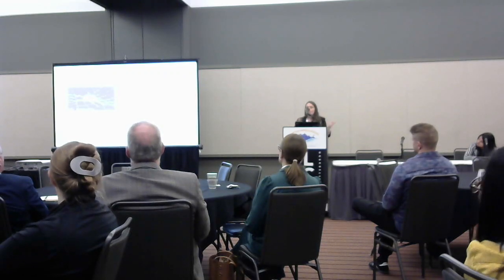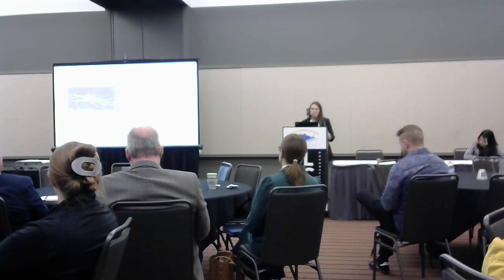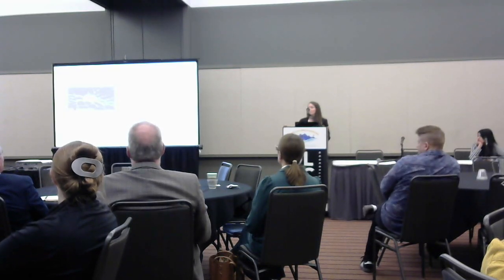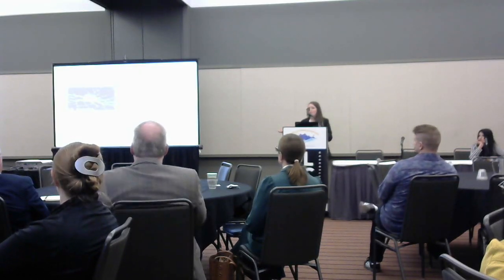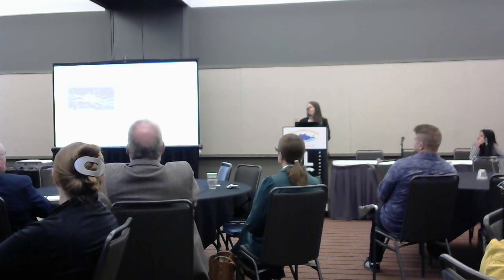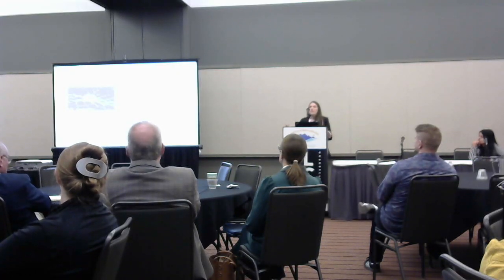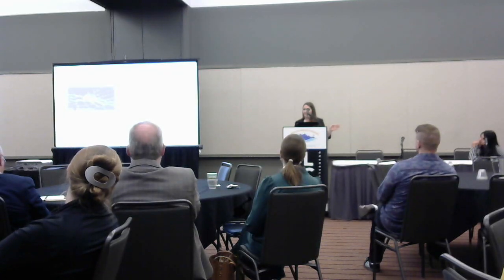Next is the type and amount of data that you're needing to process. So if you have a lot of data, batch processing might be something that's quite important to you. Different software packages do different amounts of batch processing. Some are easier, some are harder. You might also consider how big your images are, what kind of computational power you need to have. I think Aarya is going to talk a lot about that, so I'm not going to touch on it right now.